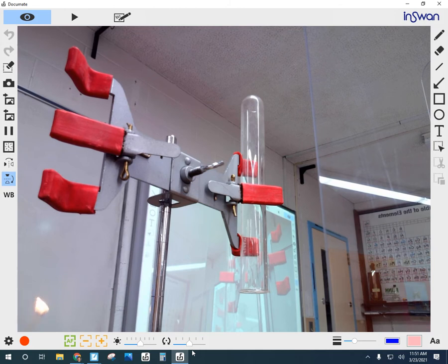Here we go. Different tone to it, right? I thought it wasn't going to go, but it did. And you can really see the water vapor that formed as the reaction went to completion. That water vapor that formed in gas form hits the cooler glass and it condenses into little tiny droplets. So that one actually worked pretty well.